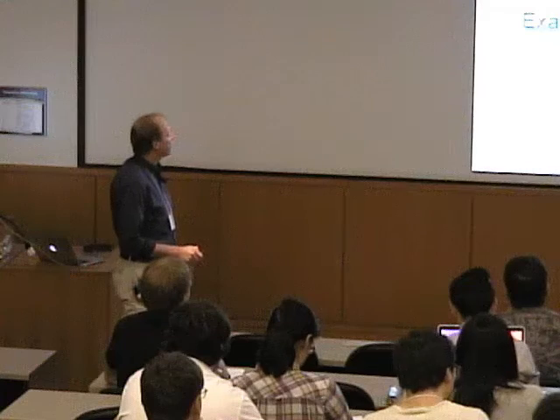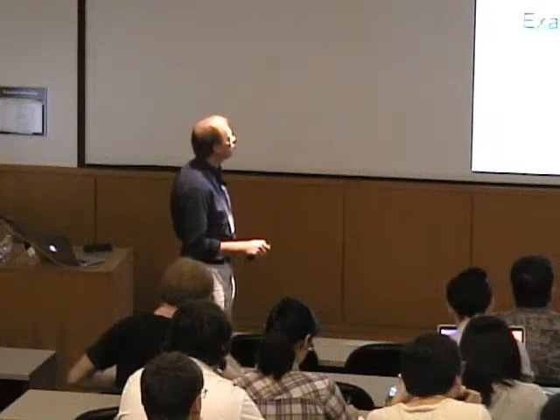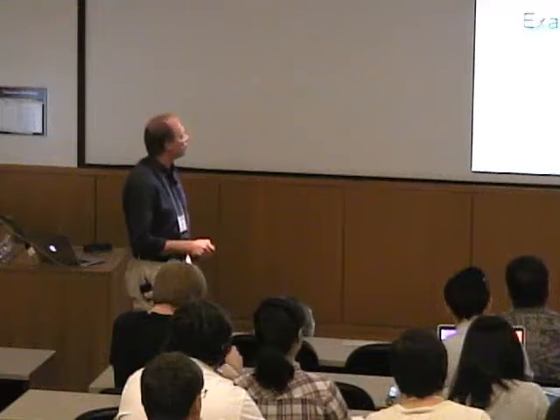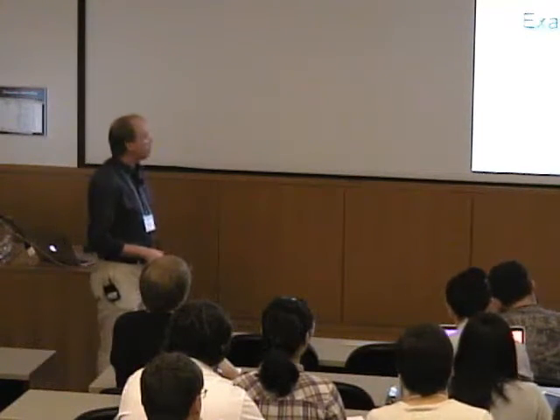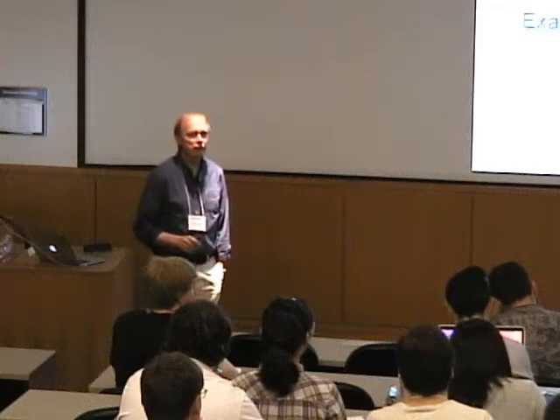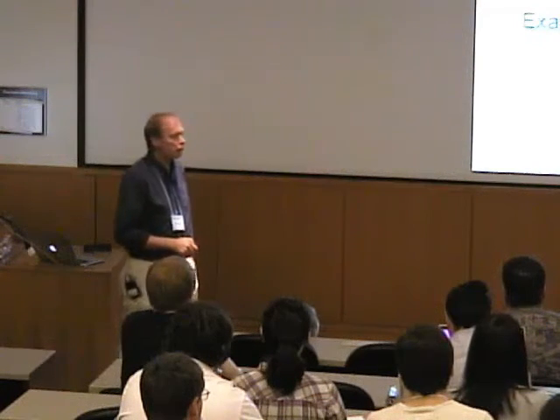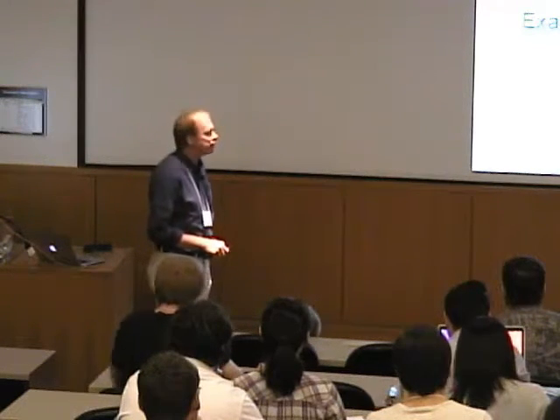There are really two general classes that we'll cover here. There are metals where the spin is a half, and then there are situations where the spin is greater than a half, right? And it turns out their EPR spectra are really quite different. Anyway, these states can be studied by EPR, and what's important here is that we don't detect molecules that have all their electrons paired. If I have a large protein, I don't see anything from the protein, and all that I will detect is the metal, right?